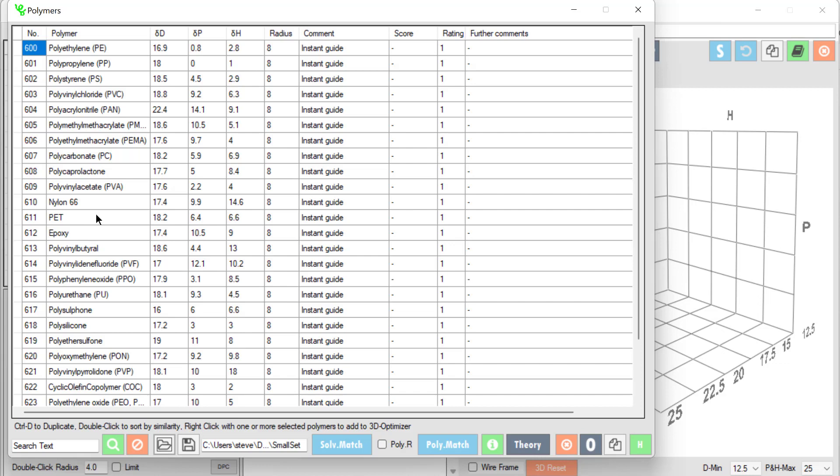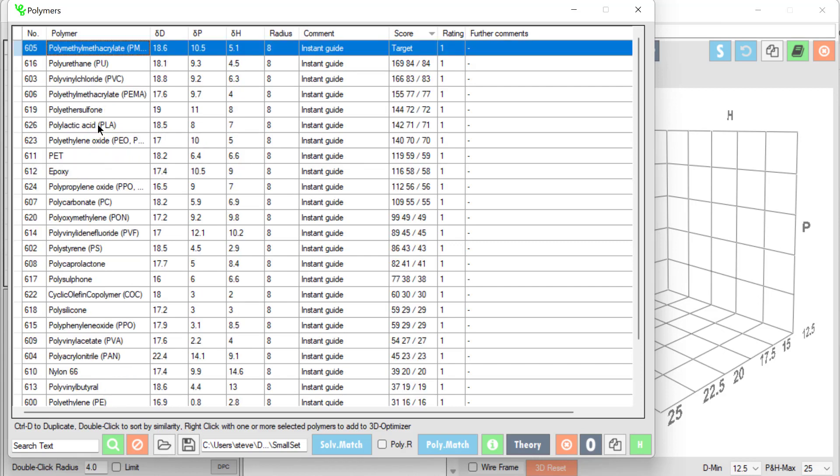The first thing I can do with these is try and find compatibilities between polymers. So suppose I'm interested in PMMA. I double click on it and we find that it's sorted by distance of each polymer from the PMMA.